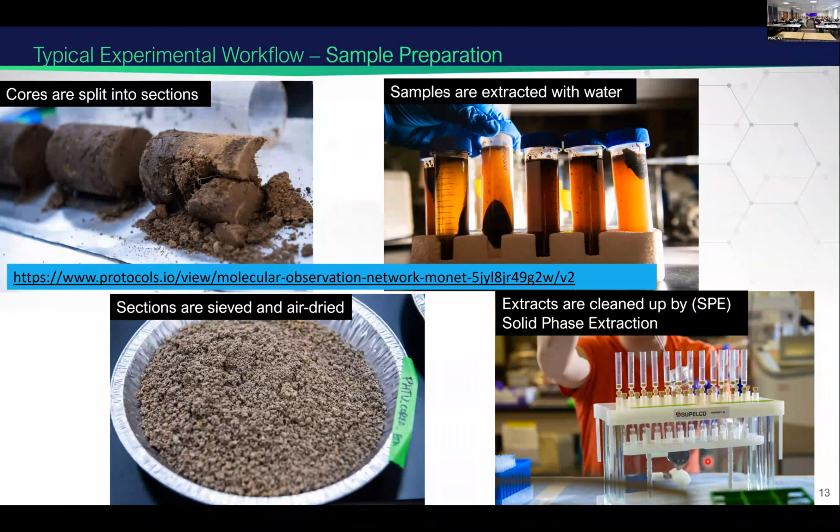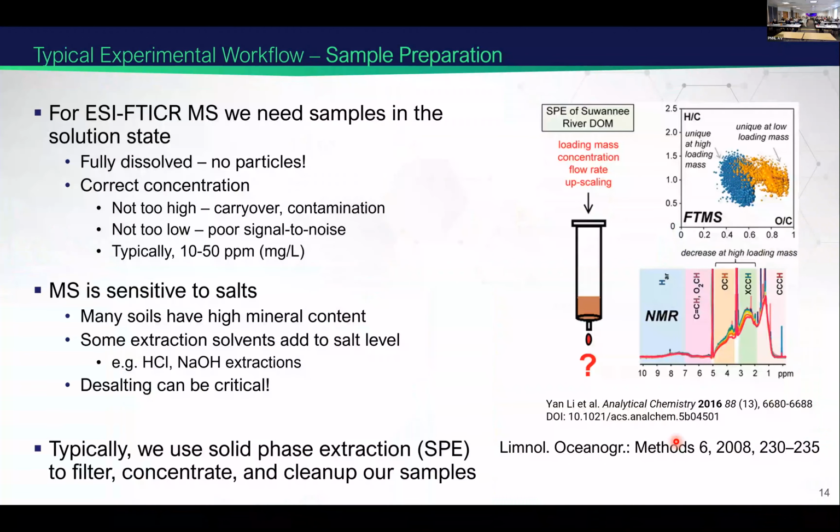Likewise, we often have to clean up our samples using a technique called solid phase extraction. And so what's important to know with SPE is that it is also biasing in our samples.